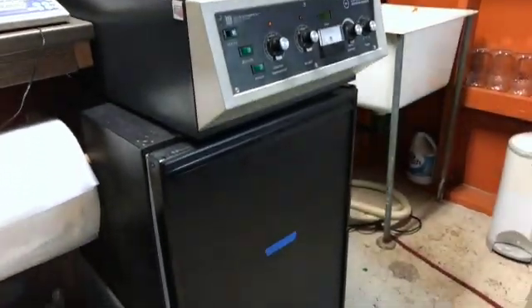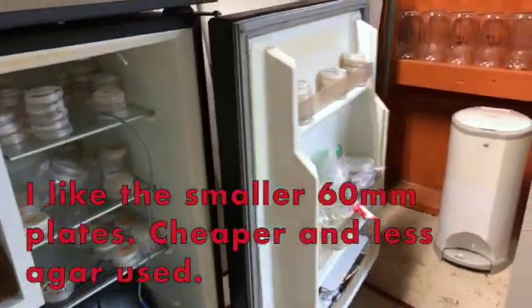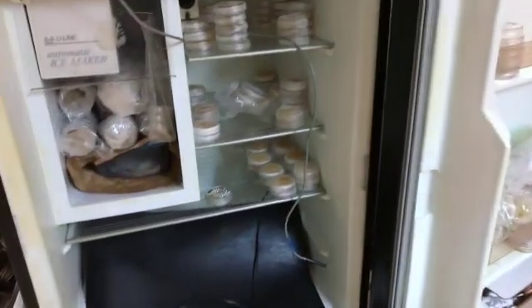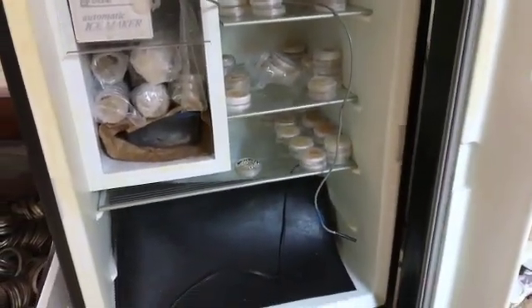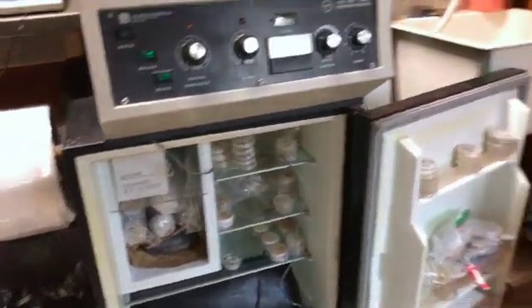Here's our little culture fridge, that's where we keep all of our cultures. You can see we have quite a bit going on right now. We also make a lot of clean agar plates that we sell.